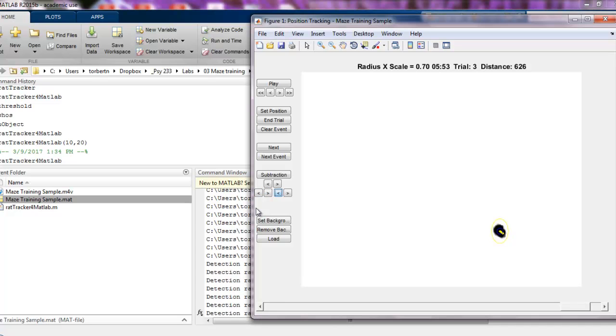But you can also make the tracking window an oval by changing the scale on the x dimension, so you can make it turn into an ellipse if you want. For most videos, you should be able to leave this at 1. It really should not be necessary to change that. Hopefully the defaults will work: the threshold of 10 and a radius of 15 is tracking well, but if not, you can adjust them here.